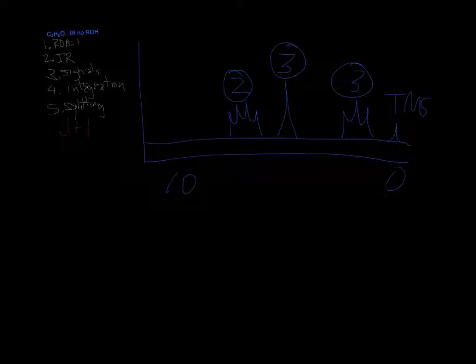Okay. Oh, and one thing I forgot to put on here on my little thing was the units. So it's delta ppm, and this is a proton NMR. That's supposed to say proton.